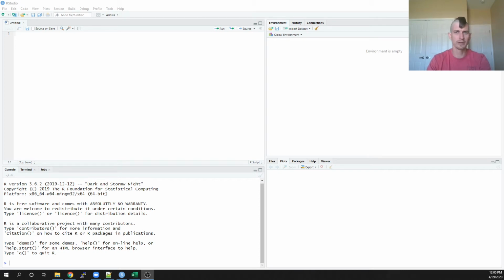All right, so I got a new video. Today we'll play around with this DESeq package to try to do some differential gene expression.